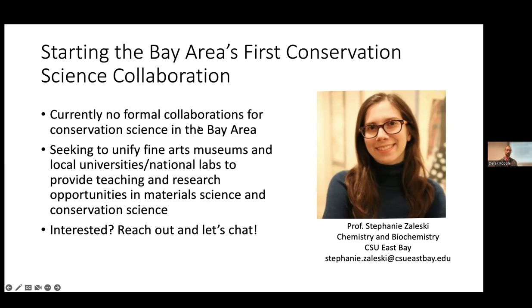Yeah, so the question is, what's the role of the oil-based paint in the oil painting and in this degradation process? This has been an interesting project for me, to get up to speed on the art side of it as well. I'm a screen printer on the side, but I don't do any oil painting myself. So I had to learn all about how people make oil paintings and the formulations of the pigment. My understanding is that you have the pigment particles, which are typically inorganic, and you grind them in the oil. The oil helps to disperse the pigment particles, and it also creates a matrix that helps to support them. That's known as the binder in oil painting.